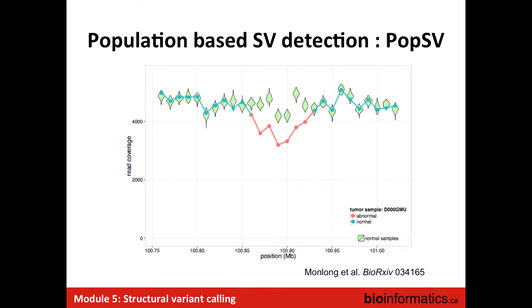Yeah. And for your validation set, does it have to be done with library prep in the same way, the same sequencing machine exactly? Like everything has the exact same parameters as far as the sequencing, so that any variation is from the sample? So you can't just pull available genomes off? Yeah. You need to have homogeneous controls as usual. Otherwise, it will work for a lot of bins, but some bins will be crazy.